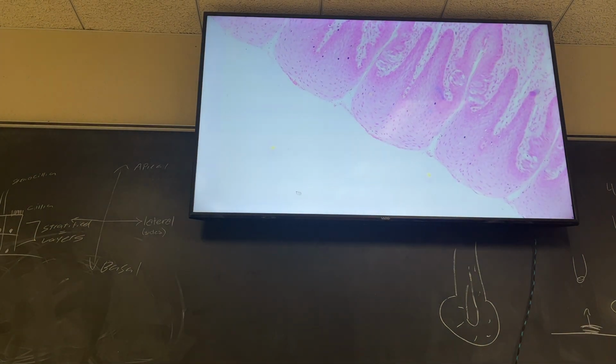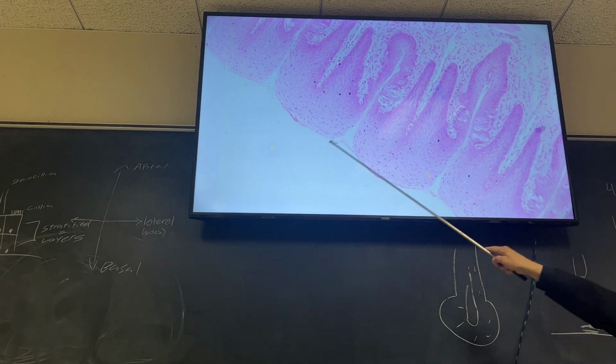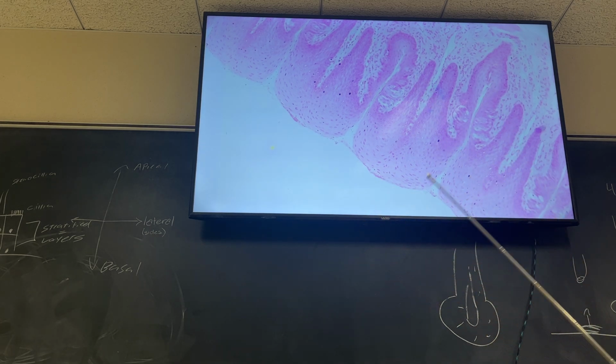Yeah. Let's go up to the surface. On the surface, let me go down one magnification here so you can actually see. On the surface, you have these things. It almost looks like teeth, doesn't it? So you have these little hill-like structures, if you will. And what are those hill-like structures called? It's Latin for hill. I'll bet you don't know that, right? What's Latin for hill? Papilla.